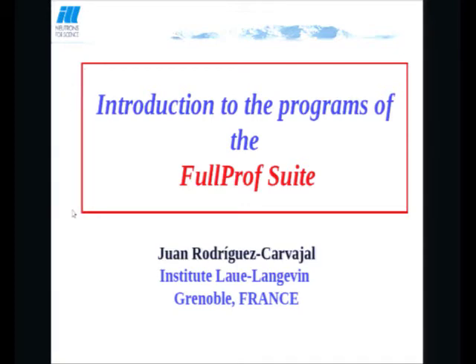So I will go through the features of FullProf, which I think would be interesting and maybe also slightly different to other programs. I don't think there's always competition between different programs, but the important thing is to use them for what we're good at, if they solve the problem for you. The reason I use FullProf myself is because I'm looking mostly at magnetic scattering and commensurate magnetic structures, and this is one of the things that FullProf has always done, and also working with single crystal magnetic scattering, including polarization analysis and things like that.